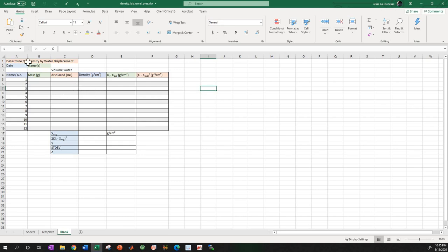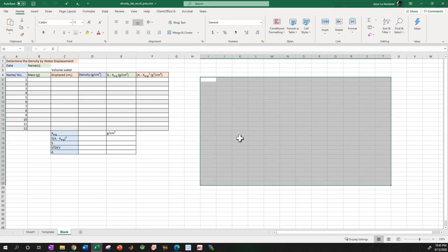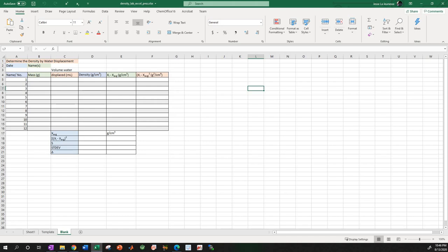So here we go. I'm going to give you a little bit of a rundown here, but I'm going to go through this brief, and I might make another video to show you some finer points of Excel that really show you the full power of it. But essentially, here's what's going on. These are just little blank blocks and grids. You have A through Z. You can actually go beyond that and go double A, double B, however. And then the rows are going to be numbered.